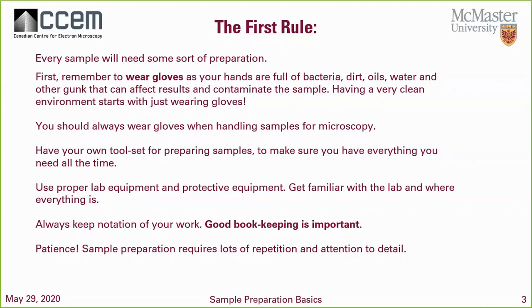Because every technician is different. Obviously, the proper use of lab equipment and protective equipment is extremely important, right? And always keeping good notation. Good record keeping is huge. And of course, my favorite at the bottom, you have to be very, very patient, okay? Sample preparation requires a lot of repetition and attention to detail, which you'll see later.